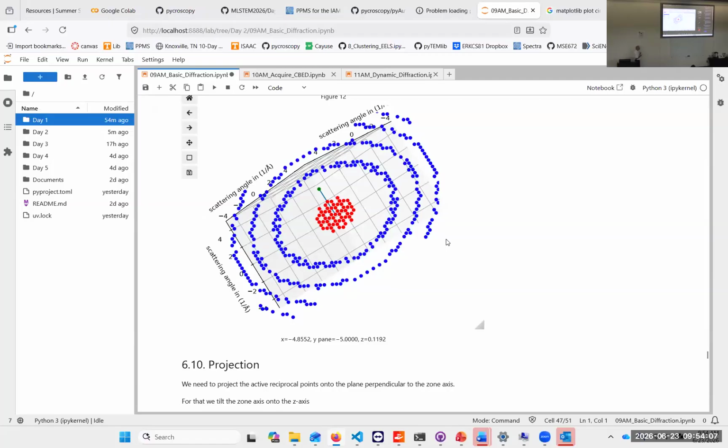So what we are looking for in this diffraction pattern is always symmetry. It is the symmetry, and the symmetry, obviously, if you have a cube and you look down, say, one direction, so you look at the face of a cube, then you see a square. You tilt it by 45 degrees, so you look at the cube edge on, then it's a rectangle in projection.